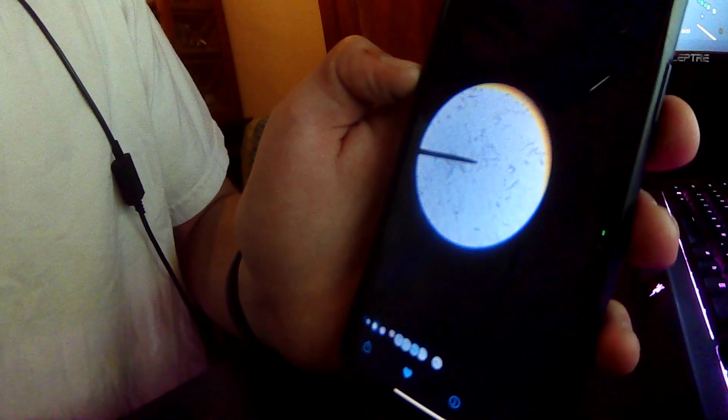As you can see, they're just little straight lines. It looks very jagged, almost like little pieces of glass in there because it's so clear. The next experiment on staining would help with that a lot. But because I smeared my dental tartar on there, it was much easier to find. It looks to me that dental tartar is in the form of spirillum.